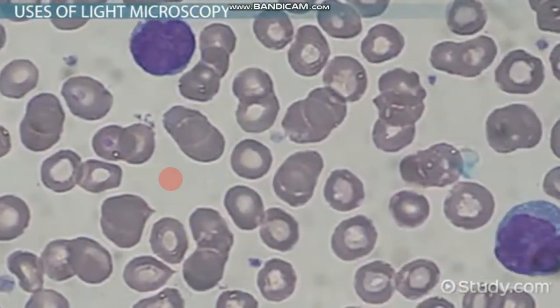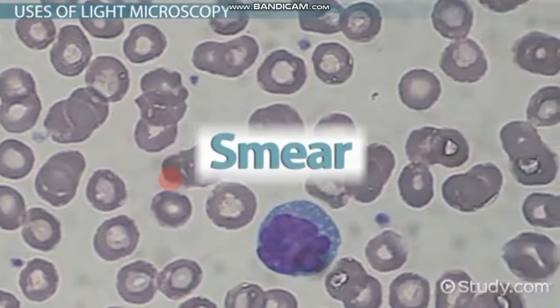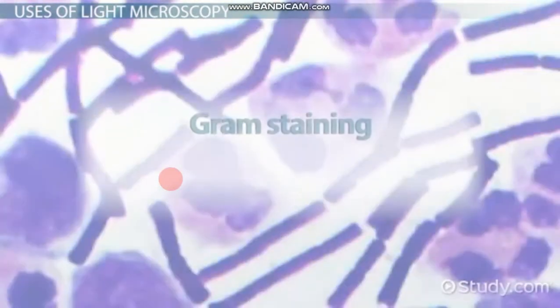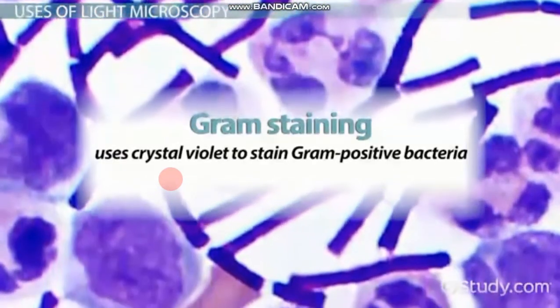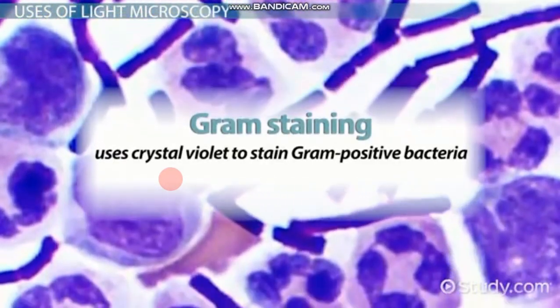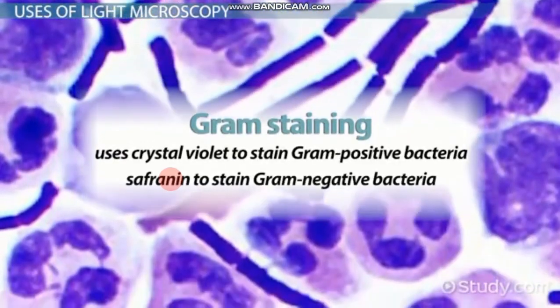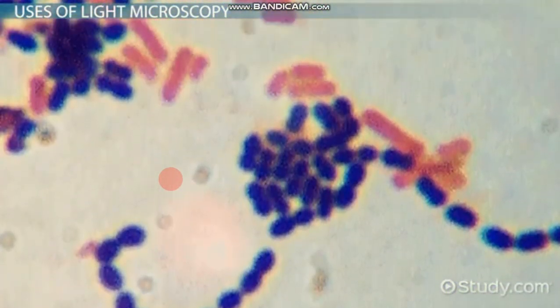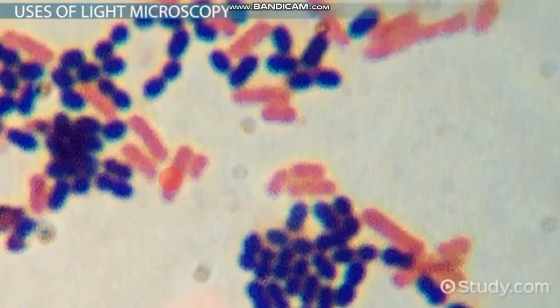Staining involves adding special dyes to a smear of cells. These stains are diagnostic for different kinds of cell membranes. Gram staining, for instance, uses crystal violet to stain gram-positive bacteria and safranin to stain gram-negative bacteria. These will show up in the light microscope as purple gram-positive cells and pink gram-negative cells.